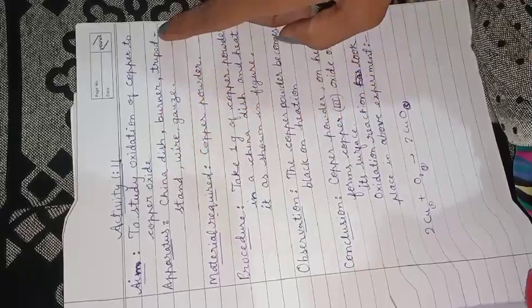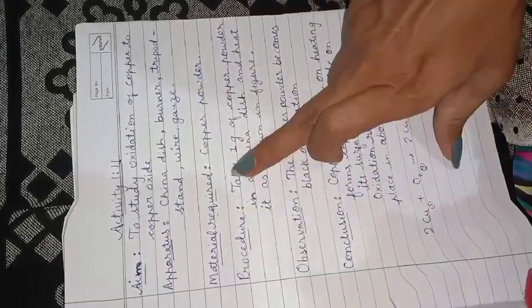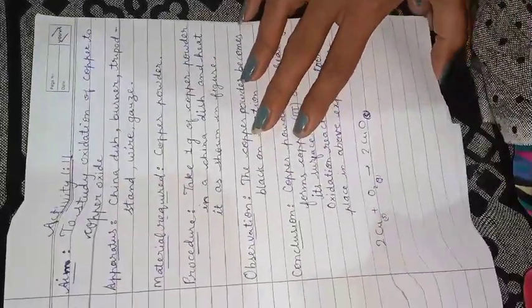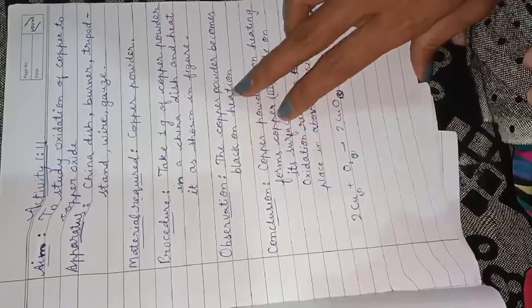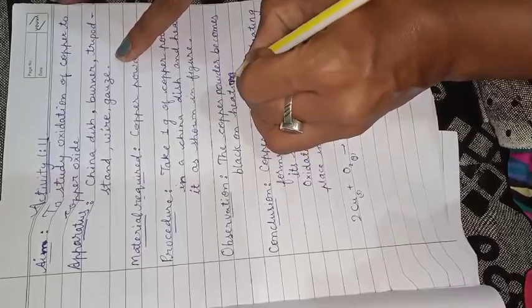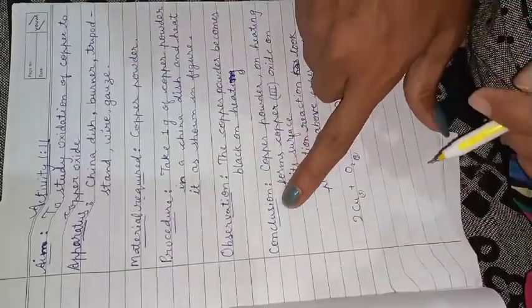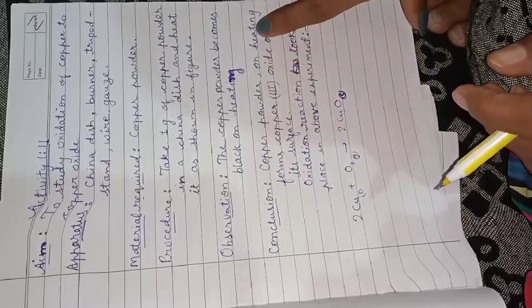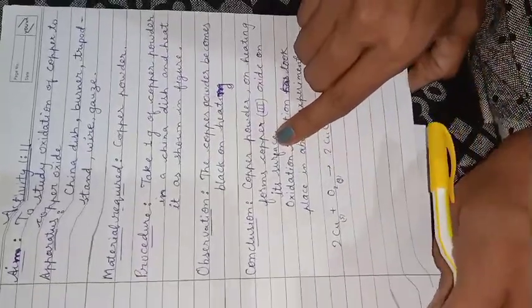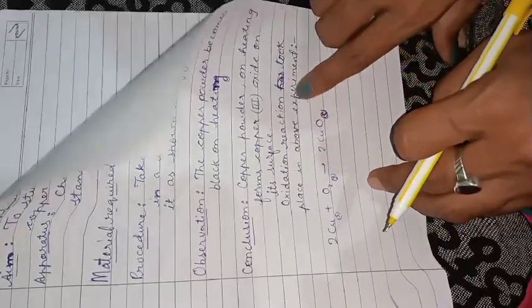Apparatus: china dish, burner, tripod stand, wire gauze. Material required: copper powder. Procedure: take 1 gram of copper powder in a china dish and heat as shown in the figure. Observation: the copper powder becomes black on heating. What will be the conclusion? Copper powder on heating forms copper(II) oxide on its surface. So on the surface of the copper powder a black substance will form, that is copper oxide. Here an oxidation reaction took place in the above experiment.